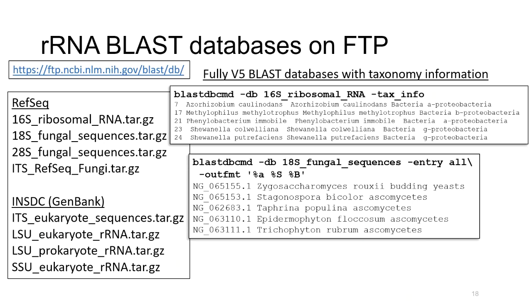The other thing I want to mention, and actually the title of this webinar, because one of the things that we want to promote is that you can get these as BLAST databases, and we're going to see in a few minutes that they're also available on the web, of course, and that's what we're going to be using for our examples. They're right there on the BLAST FTP site, in the db directory. You can get the ones we're going to talk about today, the 16S, 18S, 28S, and the ITS. These are the RefSeq databases. I will point out, and you'll see them if you go there, that there are sequences that we have gleaned from GenBank for these particular regions from other organisms. I'm not going to talk about those databases today, but you're welcome to check them out.